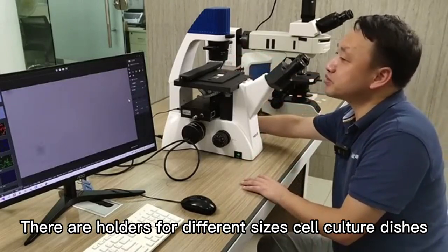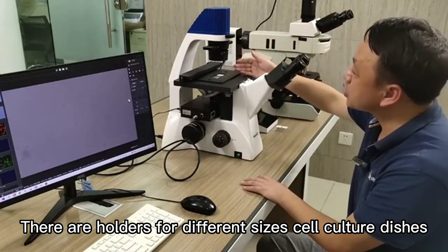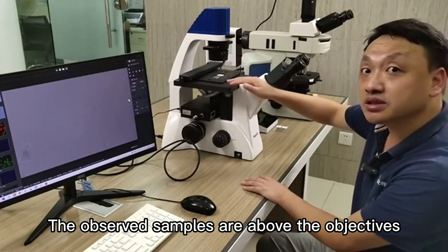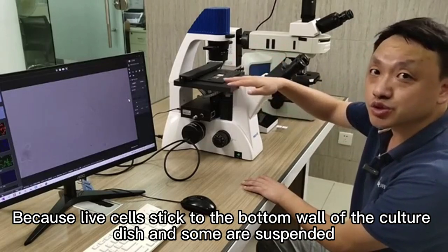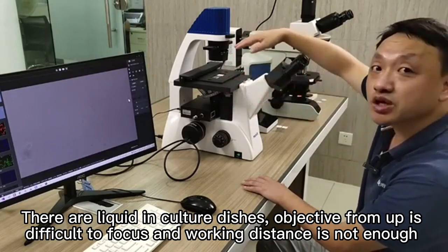There are holders for different sizes of cell culture dishes. The nosepiece is below the stage, and the observed samples are above the objectives. Because live cells stick to the bottom wall of the culture dish, and some are suspended, there is liquid in culture dishes.